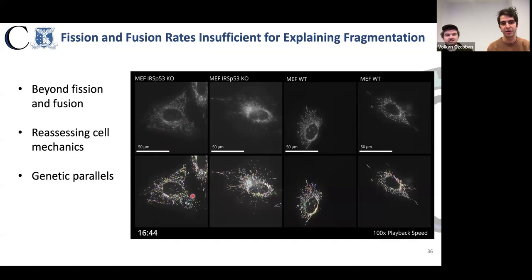And so here we have one of the knockout conditions that we've used, which is a membrane curvature protein that also localizes on mitochondria. And we've compared that to the wild type. And under these steady state conditions of genetic perturbation, they form more fragmented networks, and we continue to study those.